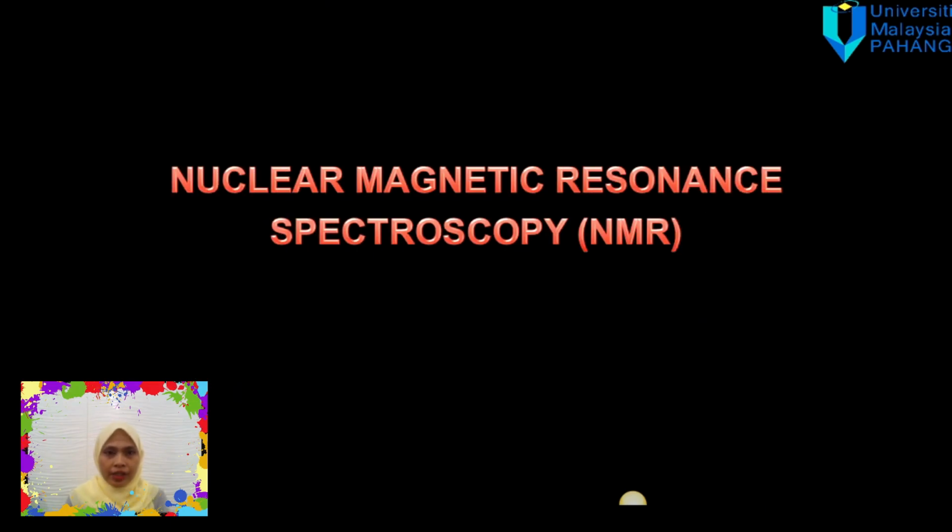Assalamualaikum. In this session, we are going to learn about nuclear magnetic resonance spectroscopy, known as NMR.